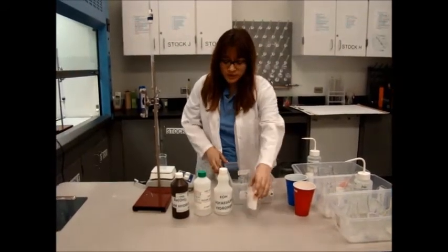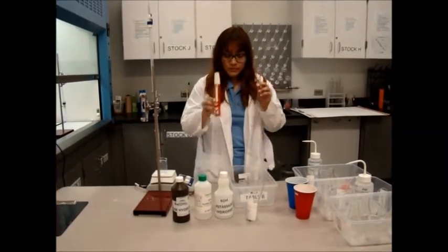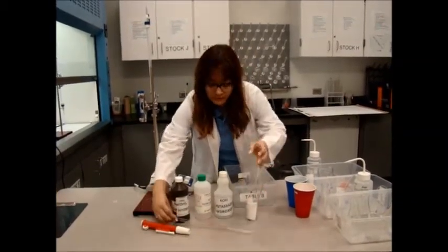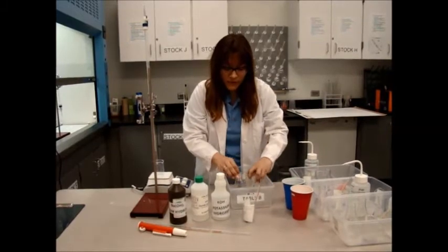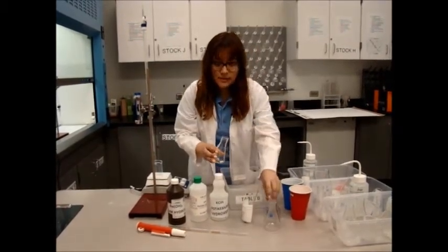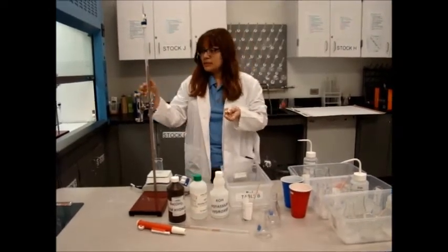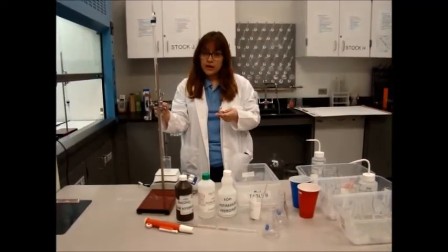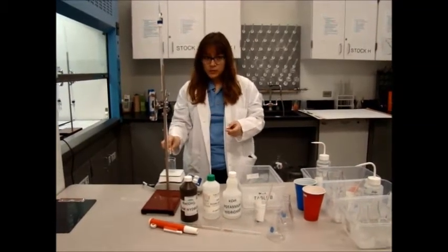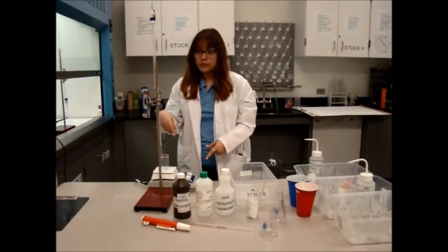Then we go on to the rest of our materials, which are going to be a 10 ml pipette with a pump. You will also have three conical flasks. Inside one of these flasks is a magnet, which you will need for the apparatus. This is a burette with 0.25 M sulfuric acid. The magnet will go inside the flask, and you will also have a stirrer to control on your burette.